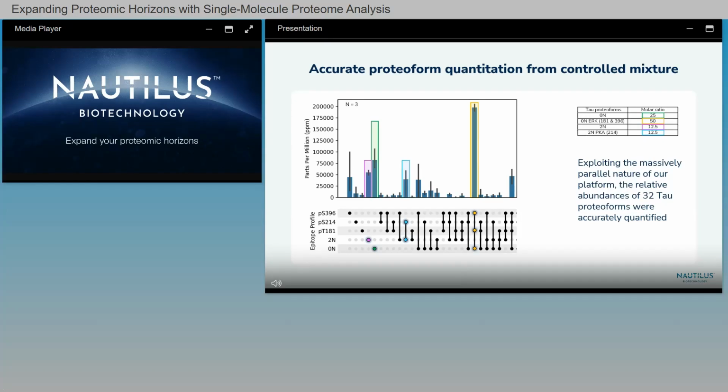I'll also note that these sites are very far away from each other, so they would never be caught on the same peptide. But as I mentioned before, this ERK enzyme is both incomplete and promiscuous, and so it really wasn't clear what the other 10% of molecules were. But you can see those incomplete phosphorylations, and you can also see that promiscuous phosphorylation. This was a panel looking at 5 reagents and measuring about 32 proteoforms.